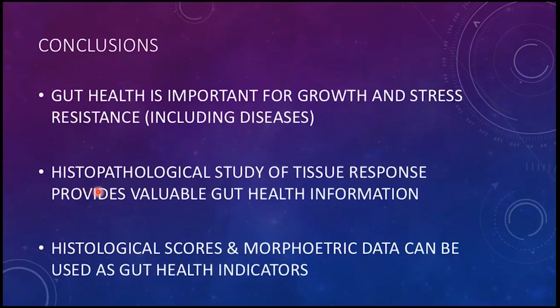Then second, that histopathological study of the tissue response is providing valuable information that can be applied for gut health. And hopefully you will agree with me after this talk that histological scores and morphometric data can be used as gut health indicators.